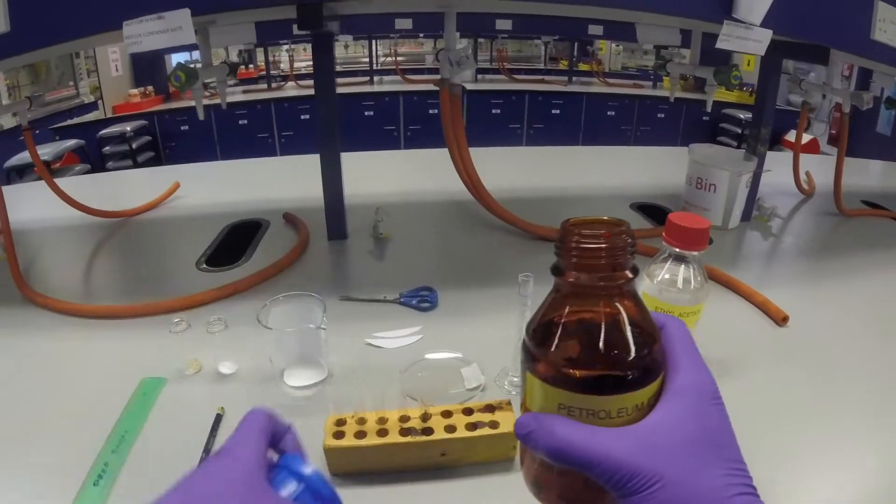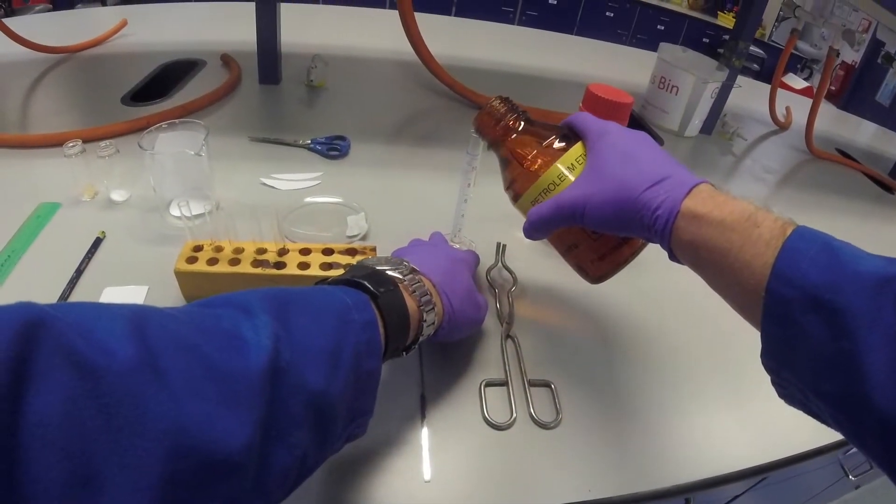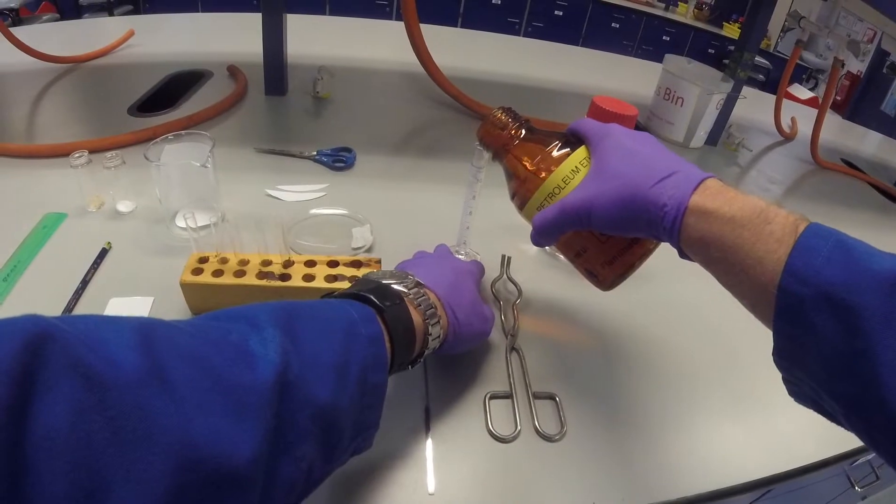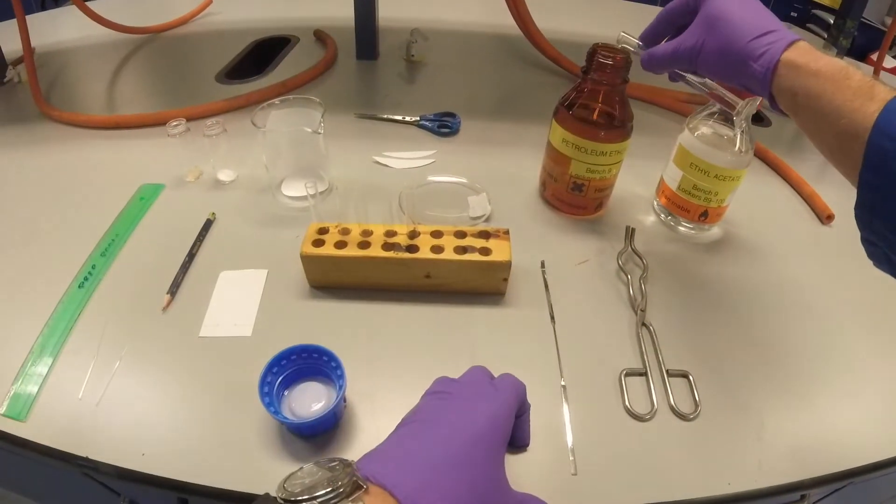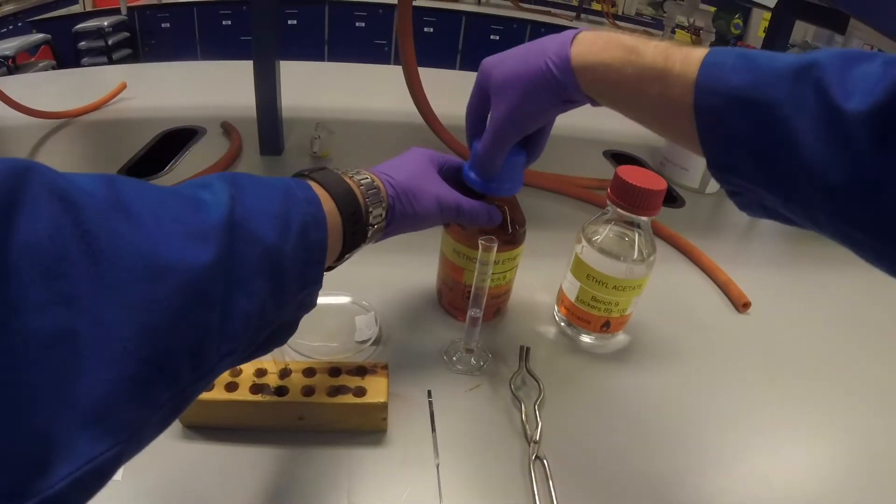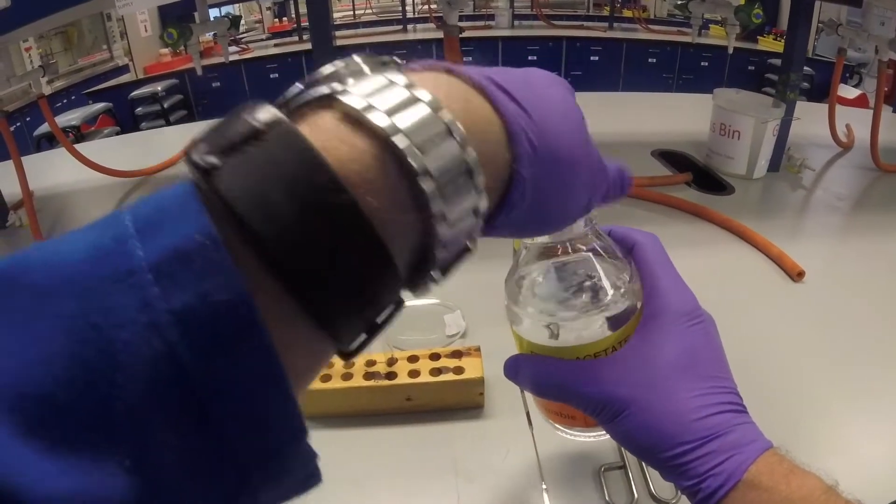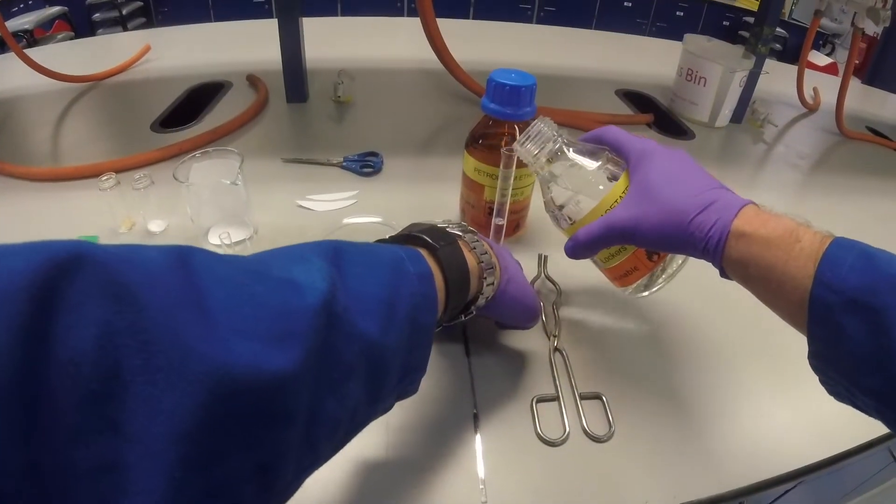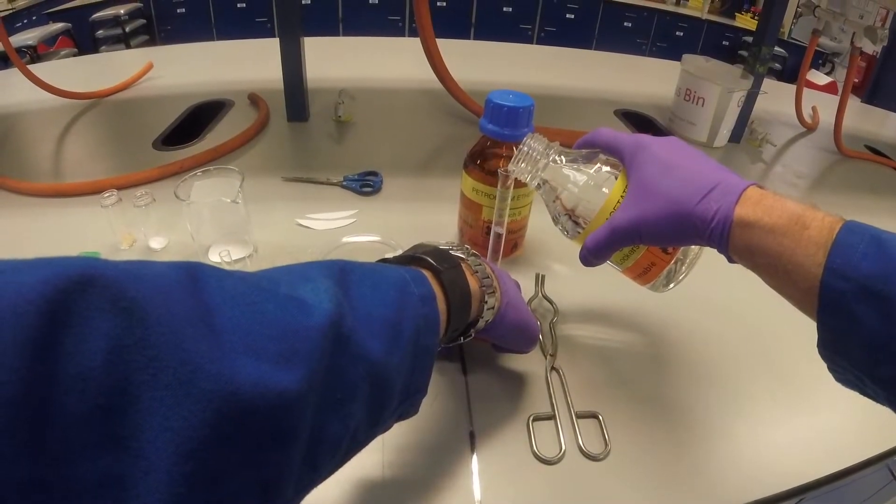The mixture I'm going to use is a 50-50 mixture, so we're going to be using five milliliters of petroleum ether and five milliliters of ethyl acetate.